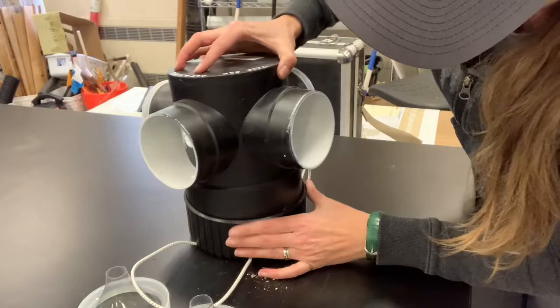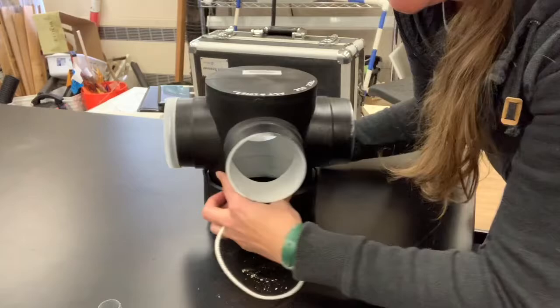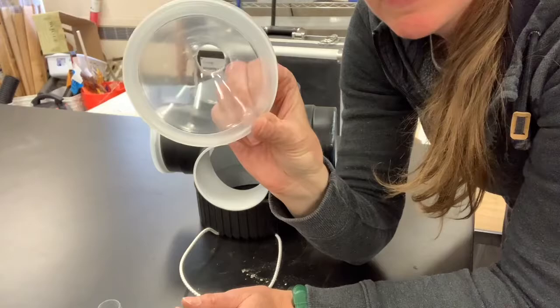There are openings in four cardinal directions, and each one has this kind of funnel-shaped lid. What's cool about this is that the light shines through this whole funnel.